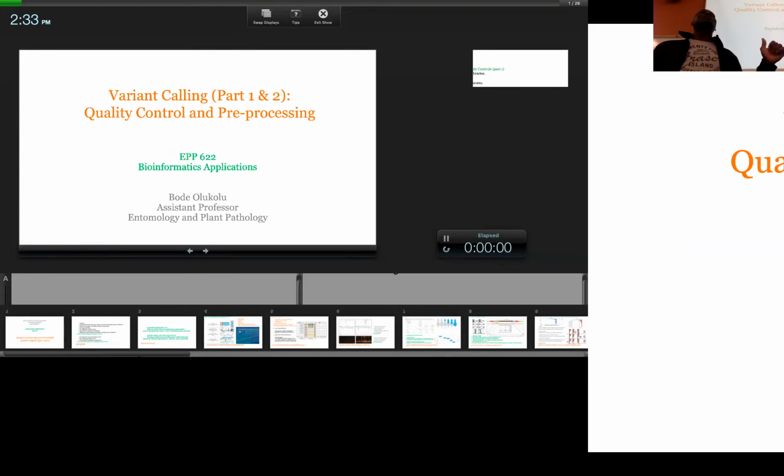Can we say we're all okay with the way the Illumina platform works? In terms of when you get your reads, you know how those reads were derived, right? If you're doing paired-end sequencing, how that physically happens on the machine, and if you're doing single-end sequencing, how that happens.